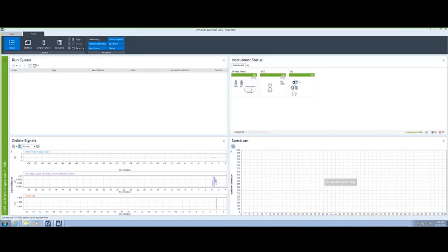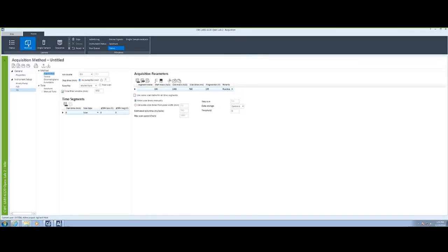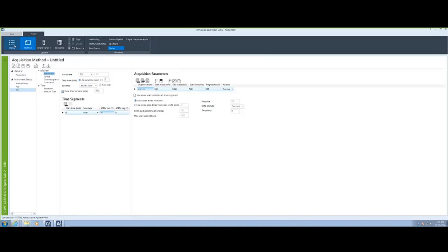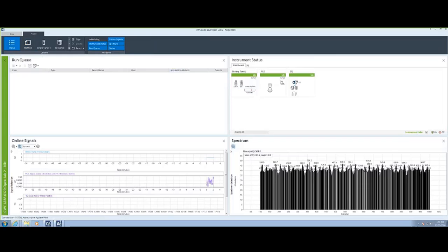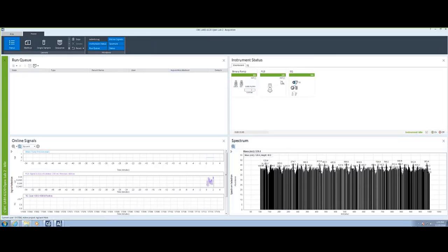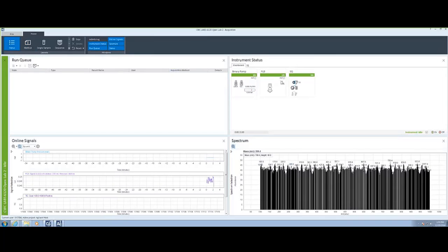In order to see spectra or online signals from the MassSpec, you must go to the method and turn on the MassSpec, give it some voltage, and then send that to the MassSpec. Those settings will now be downloaded to the MassSpec, and spectra is now available.